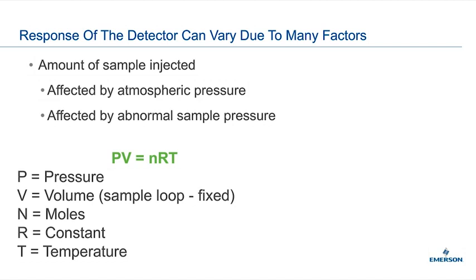It isn't that methane increases but not ethane. All the components' concentrations will increase proportionally to the increase in pressure. Vice versa, if you have a pressure drop, you get less sample in the loop, so everything will have a lower concentration and be shifted off. That's where the unnormalized total comes in, and that's where you'll see that information as well, but it will affect your response factors.